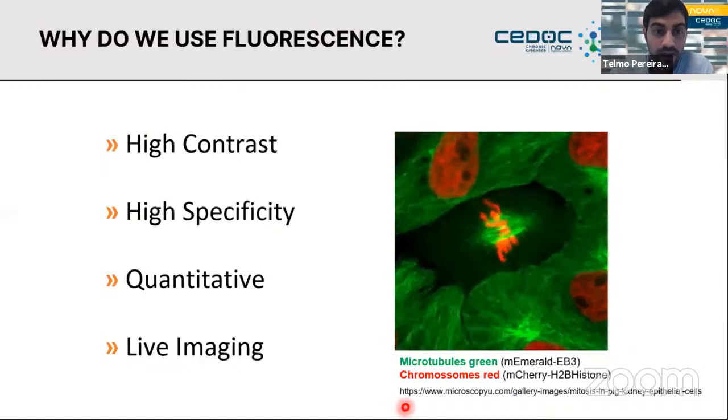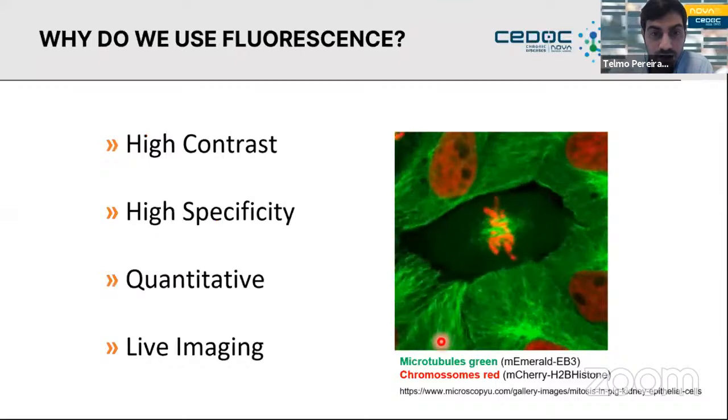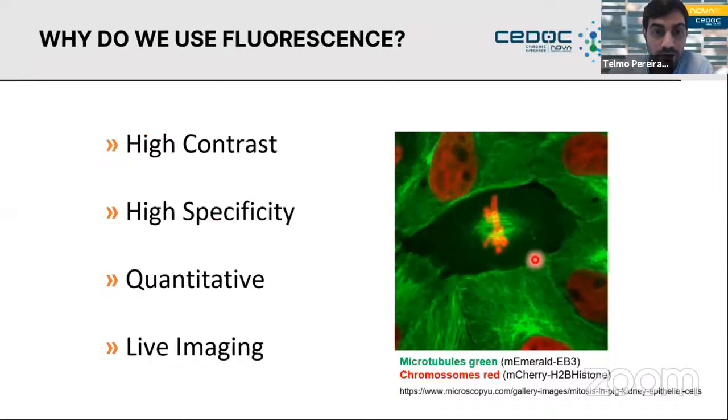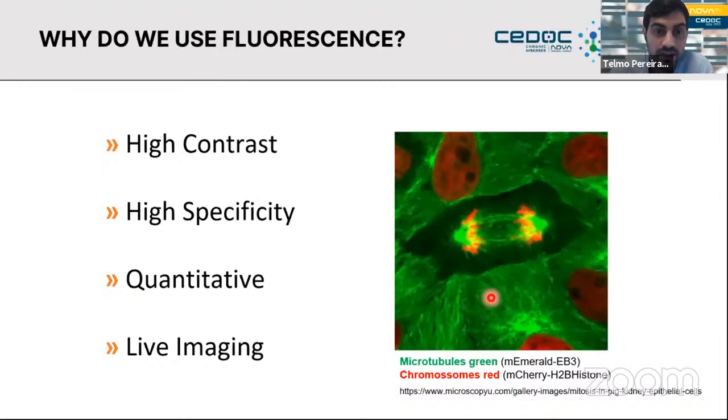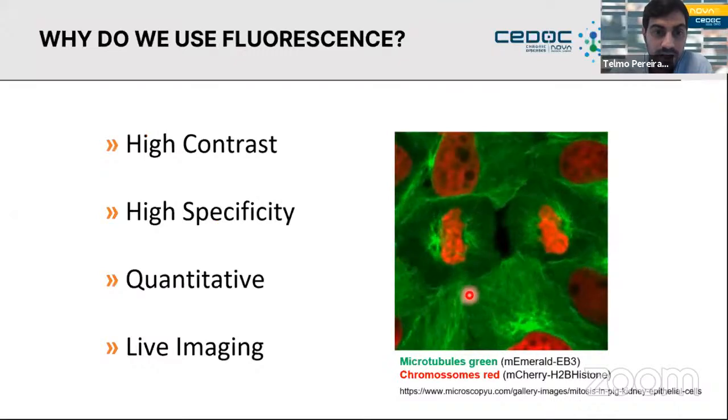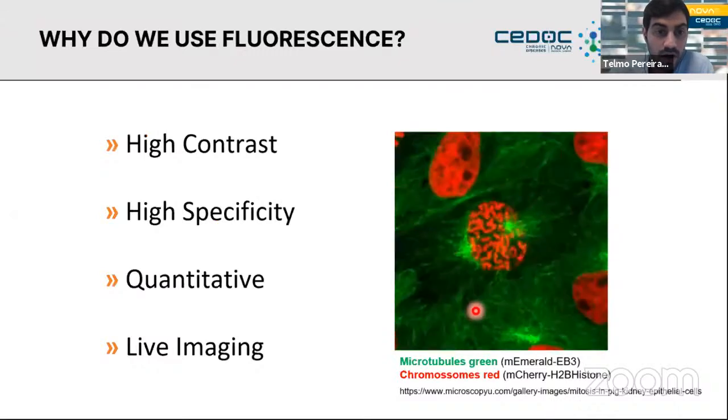So this picture that I was showing you, it's not just a picture, it's a time lapse. So you can clearly see all the signals, all the cells dividing, the DNA splitting up. So everything, you can see all these advantages of fluorescent microscopy in just one image.